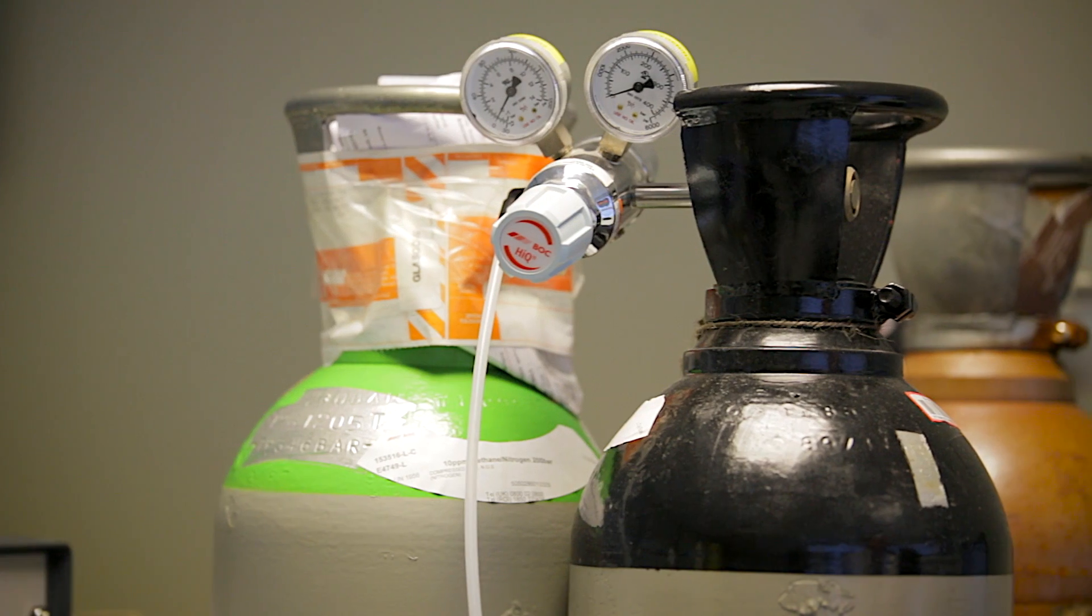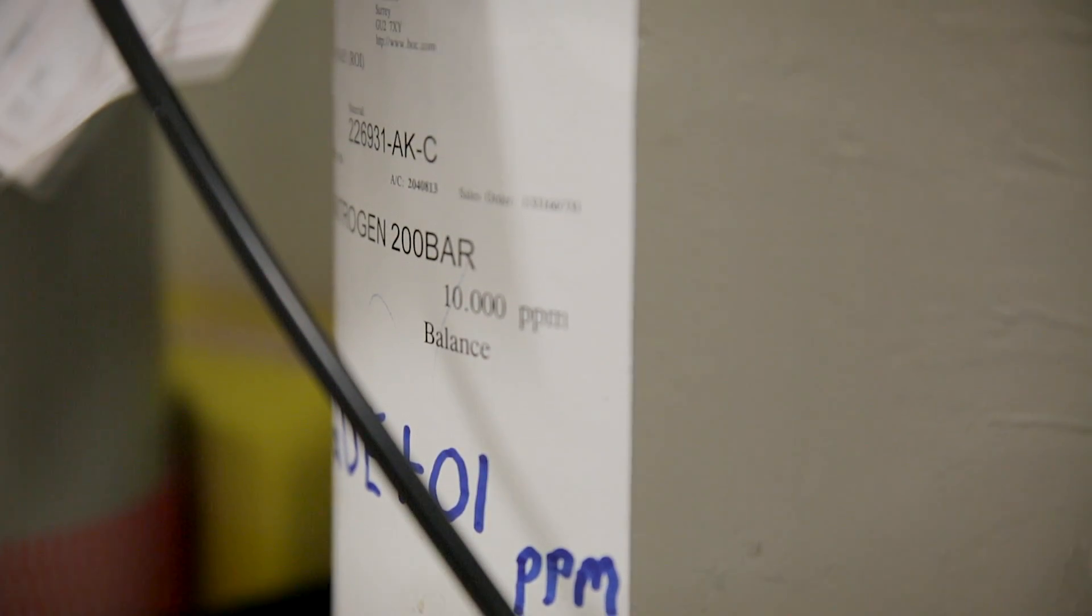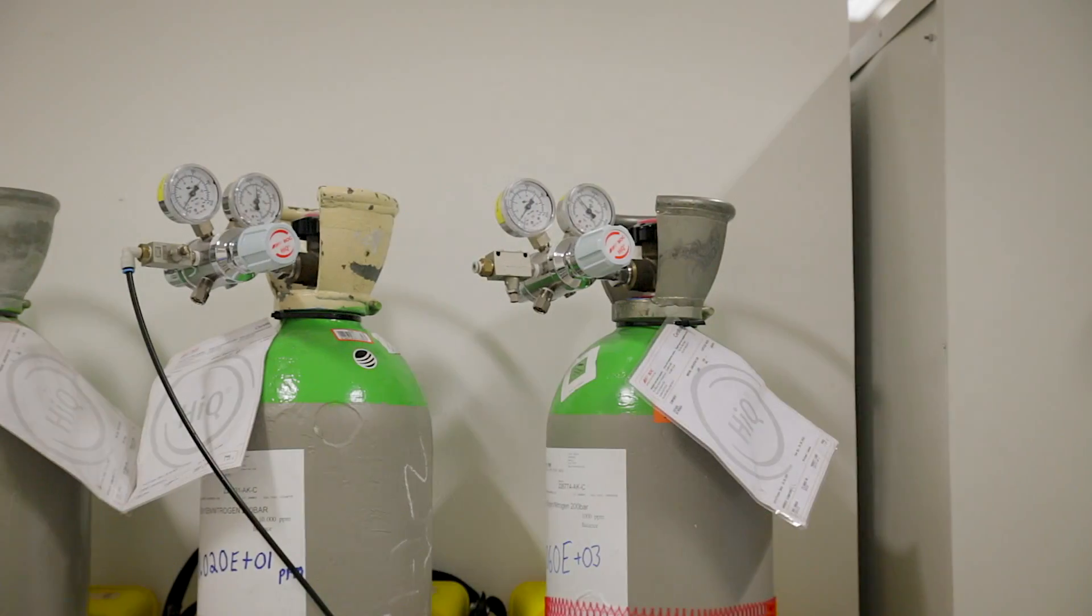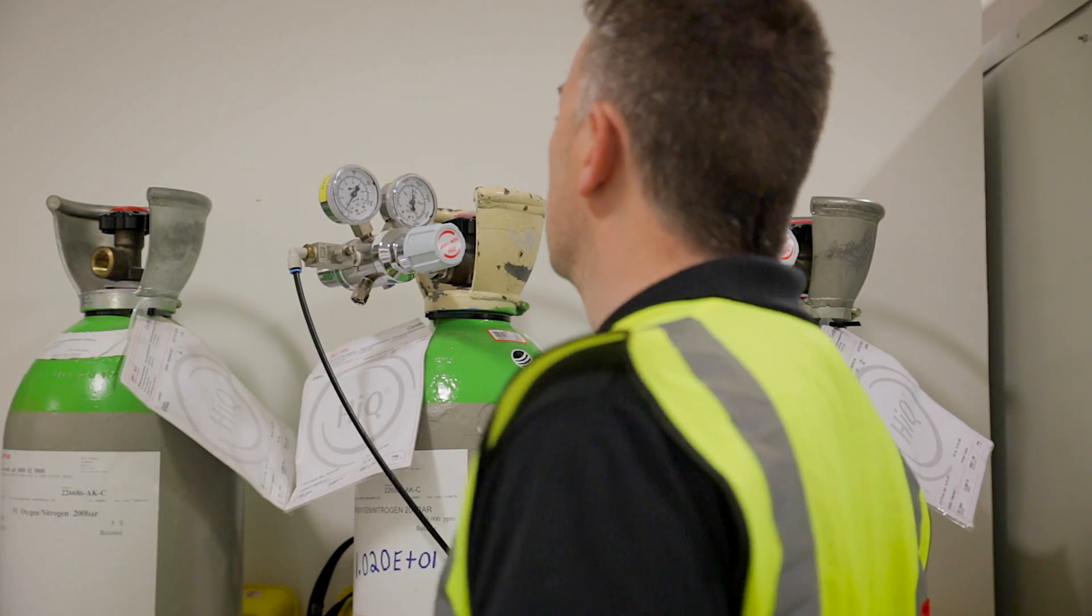Having a gas generator, you're not having to spend time changing out cylinders, not having to worry about them running out in the middle of analysis in the evening or at a weekend.